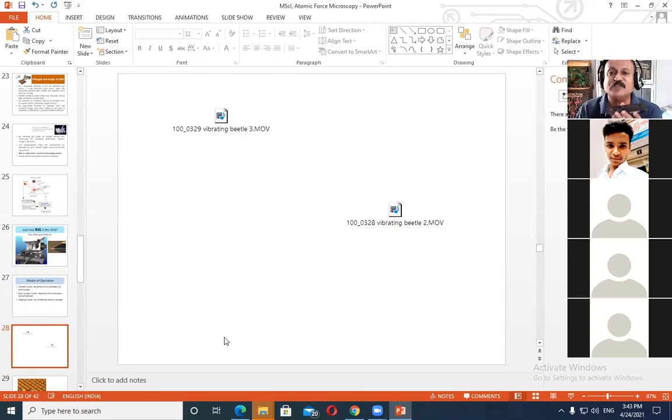Because of that, the instrument will automatically tell the probe to go up, up, up. And if there is a depression on the sample surface, then that vibration will not be sensed by the tip, and therefore the instrument will push the tip back very close to the sample. In this way, the instrument is trying to monitor the vibration, and the vibration should be constant.